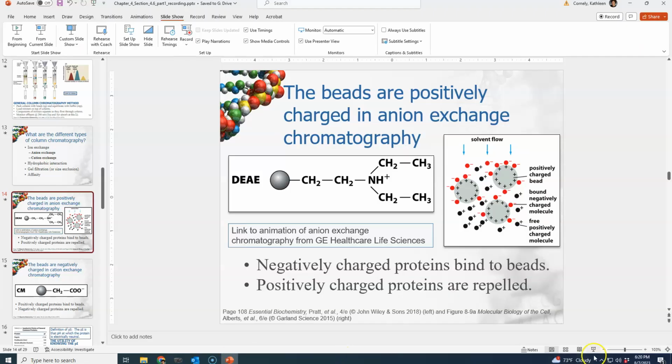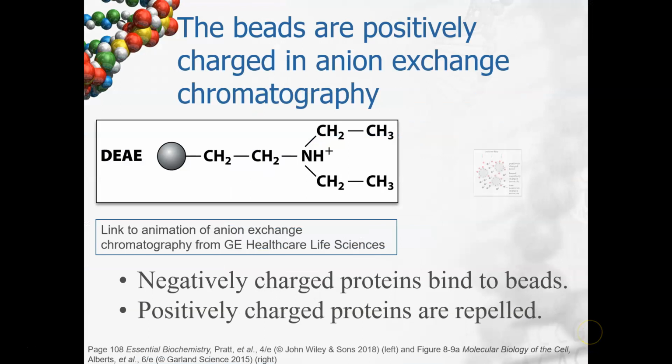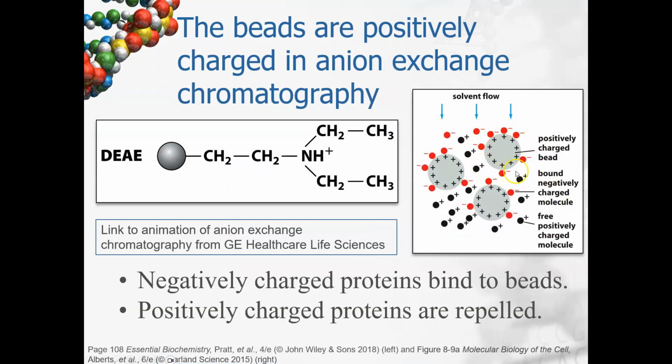So let's go back to our PowerPoint. So what's being shown in the video is positively charged beads with negatively charged proteins. In this diagram, they're shown as negative red dots right here. The positively charged proteins will be repelled, and those proteins will elute first.